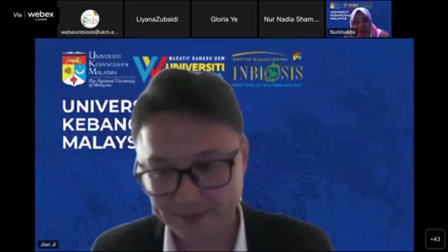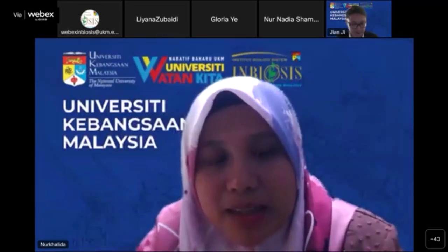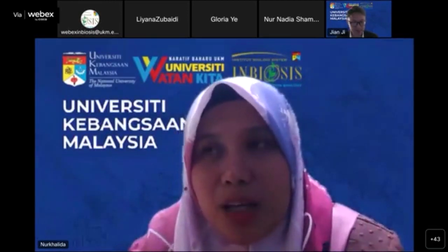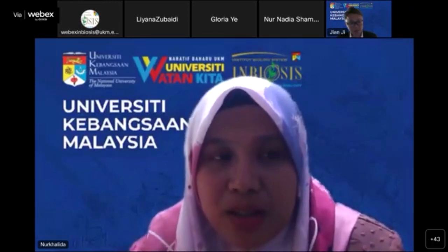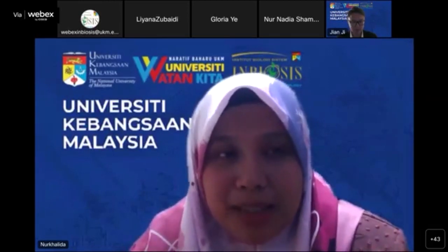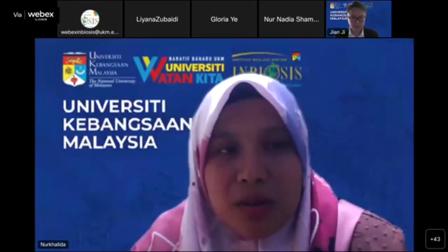Okay. So meaning, from what you are telling us, it is actually important when we run GCMS, if we can have a database that also has the unknown features, then it's good. The bigger the database is, the better for the future, for machine learning also.